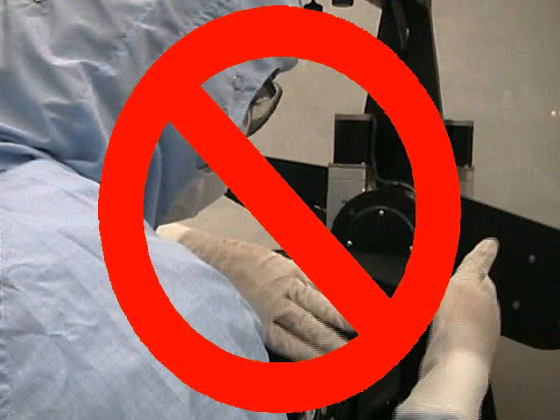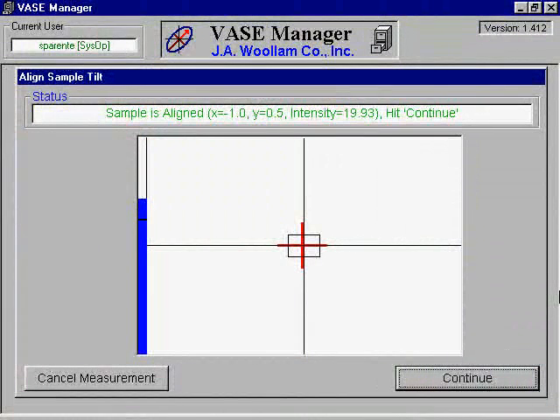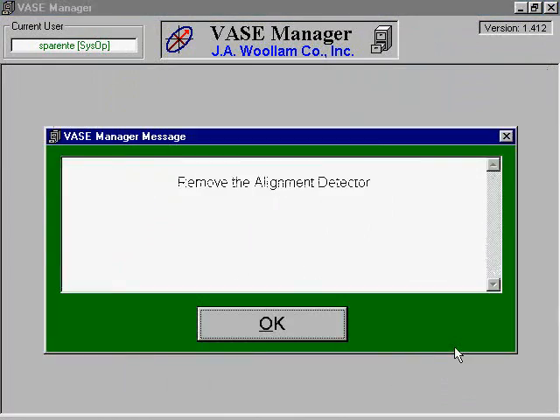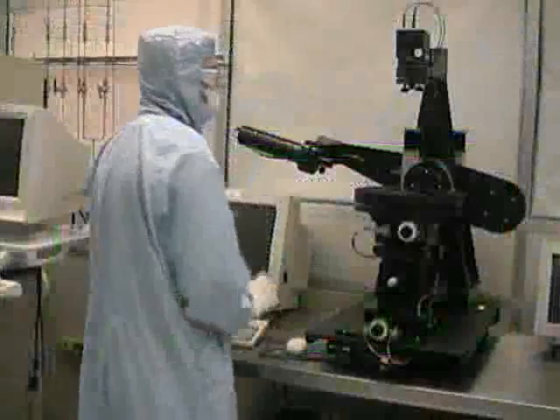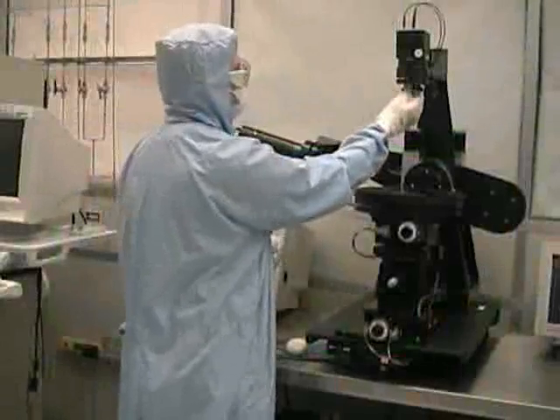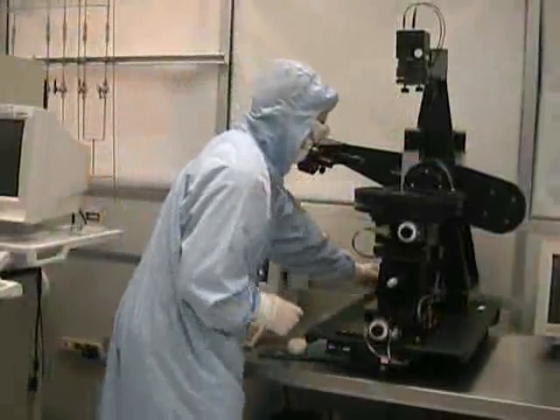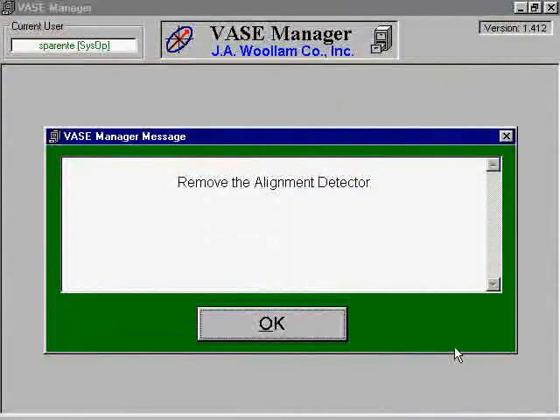You should never be too forceful with the alignment knobs because this could damage them. Once the crosshair is centered appropriately, you should be able to see a blue bar on the left side of the screen. The intensity will need to be above the minimum line for the scan to take place. When everything is set correctly, click Continue. You should then be prompted to remove the alignment detector. Once you have done this, select OK.